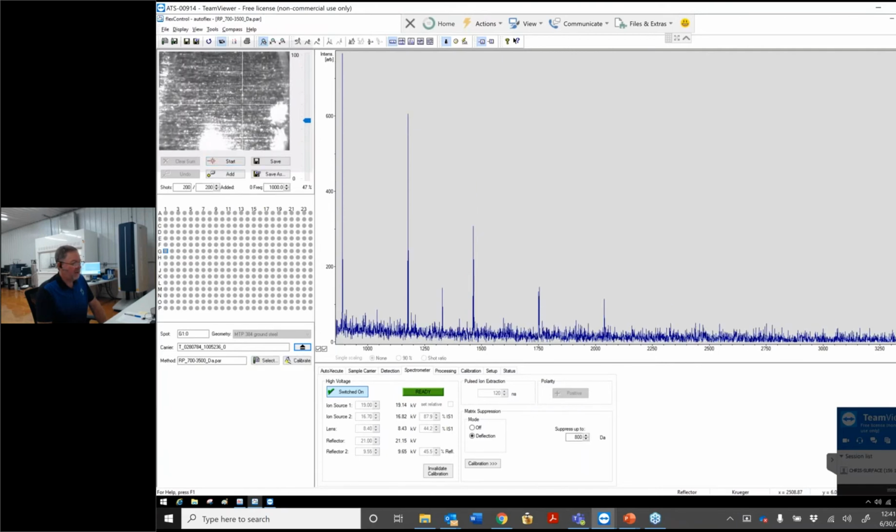little shot. That was the laser firing 200 times in that short time period. And what happened is we acquired this series of data. These peaks here are representative of Cranberry proanthocyanidins of varying polymer length. So this is the trimer, 3 links in the chain, tetramer, pentamer, hexamer, heptamer.